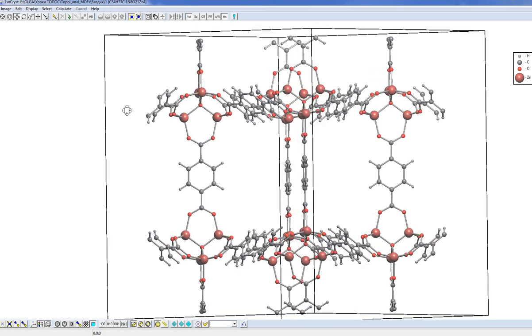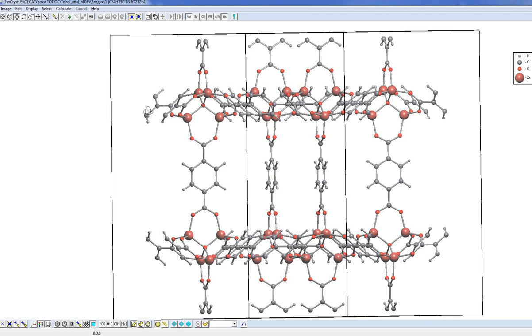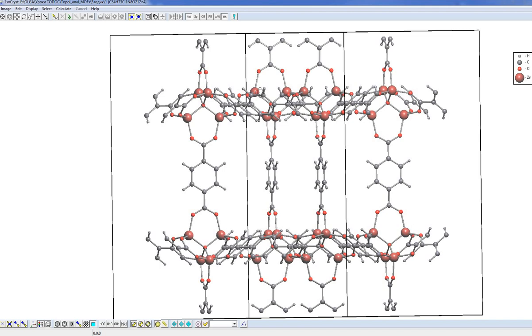Now we need to simplify the structure. This is the general route for topological analysis in Topos Pro. In this route we will find structural groups, simplify the net by squeezing these groups to their centers of mass, and finally identify the topology of the structure and classify it, and probably find the topological analogues of the structure.